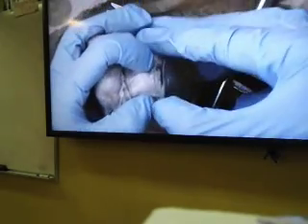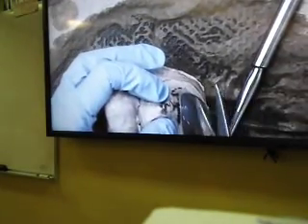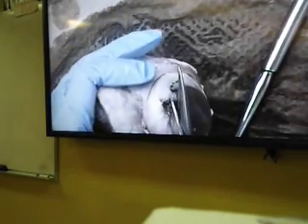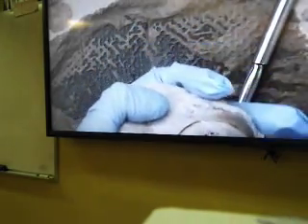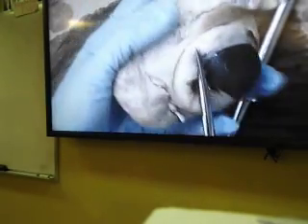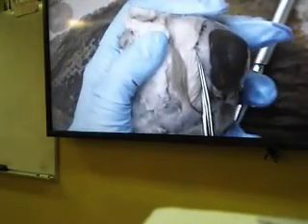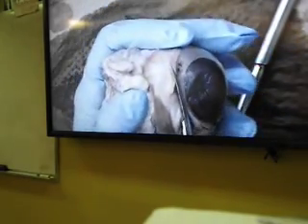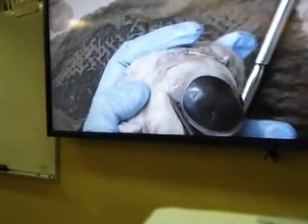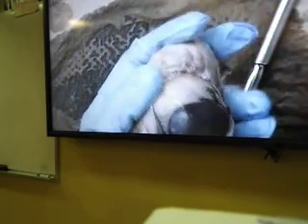So here if I look over here, where was the incision? Right here, as you see. Very tiny. But now I will be using my scissor, more aqueous humor coming out, and I make a circular cut. I want to make sure I keep 0.6 centimeter distance, at least try my best, from all sides of that circular cut. Sometimes it may go a little bit less or more than 0.6 centimeter, but you don't want to be too far away from there.